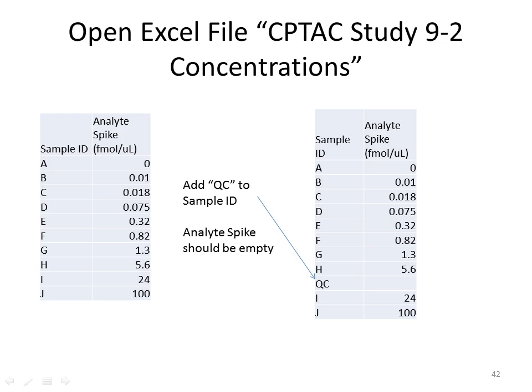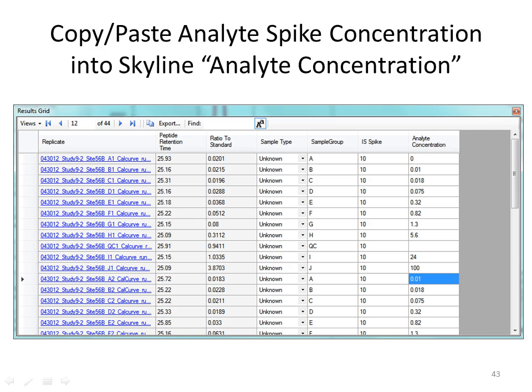Okay. So now when you've done that in Excel, if you highlight that 0 through 100, that whole range, and copy it, then you can put your cursor on that first analyte concentration cell and hit paste. That whole column should come right in and match up, so every sample A should have an A and a 0, B should have B and 0.01, and you can just keep copying this down for the 4 iterations of the curves. You got it? Because you look like you're happy, so that's good.